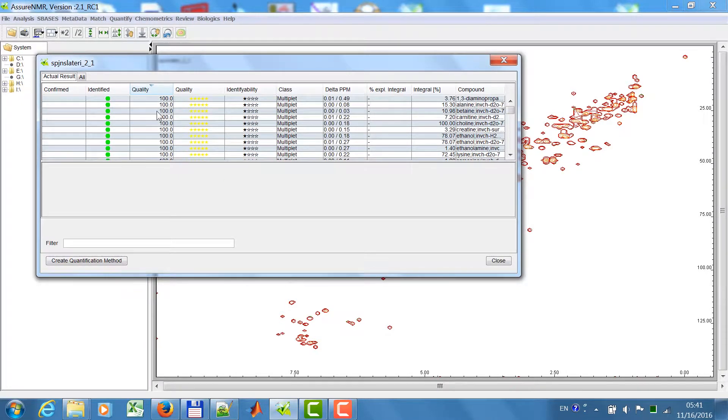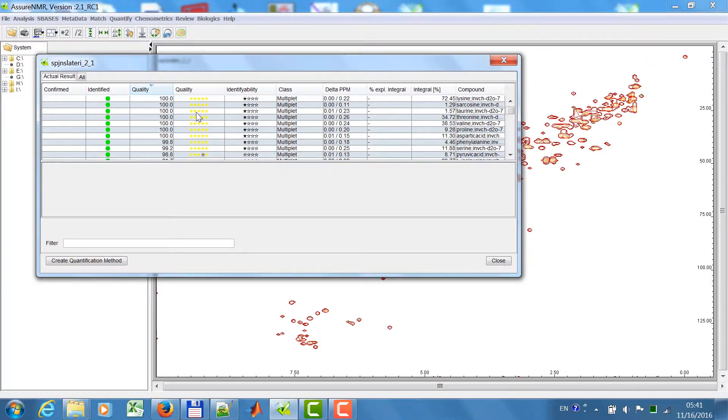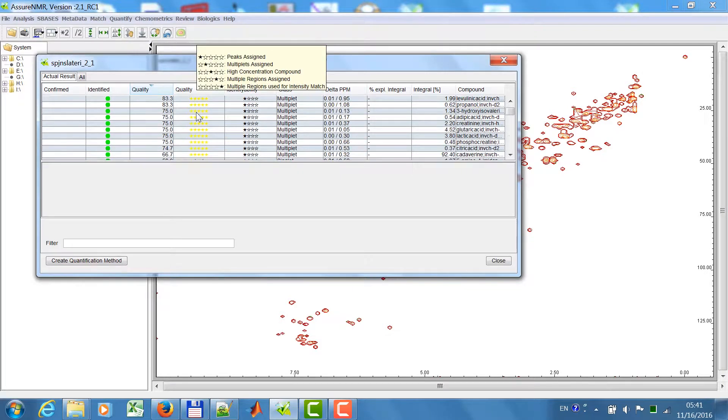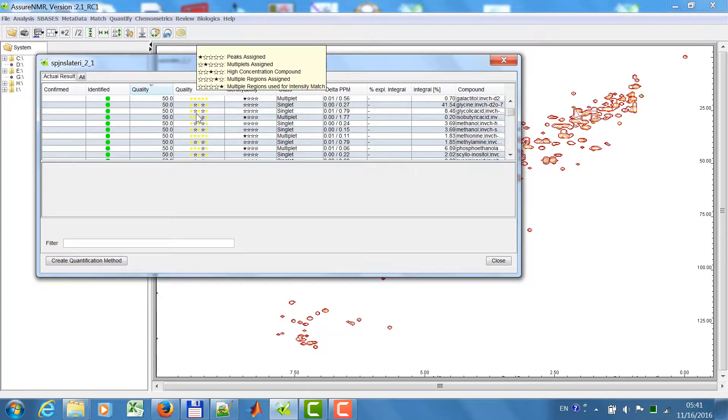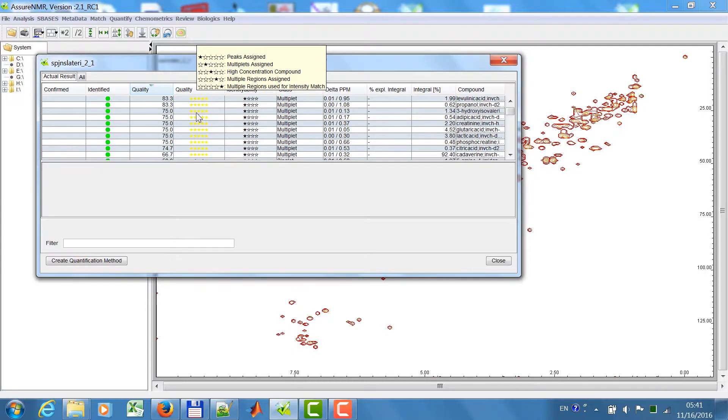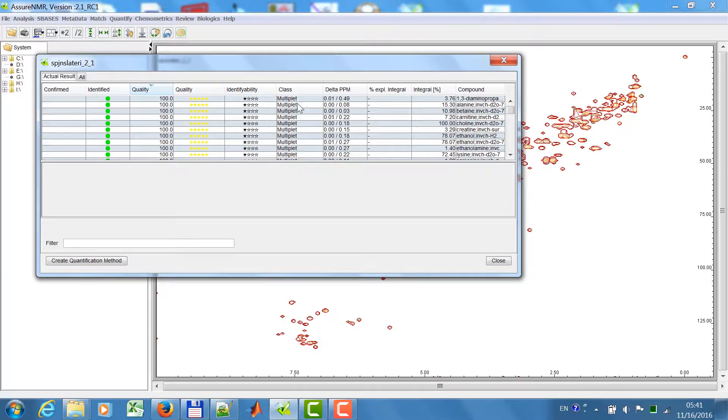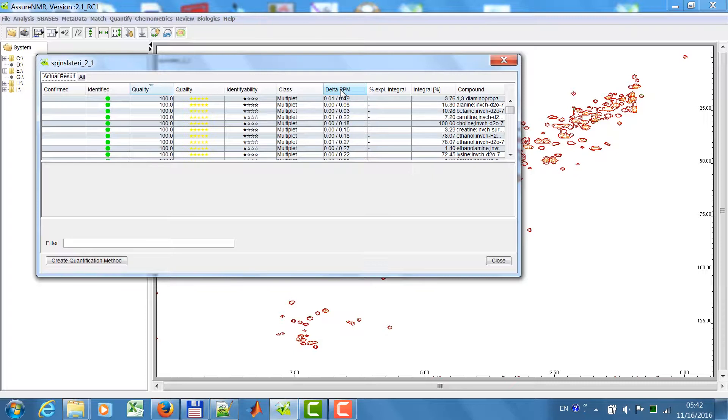Using the match quality and the match quality with several star results, you can more easily see what was done by the algorithm. Here in this column you will see the delta PPM, the shift of the individual signals with respect to the reference data.